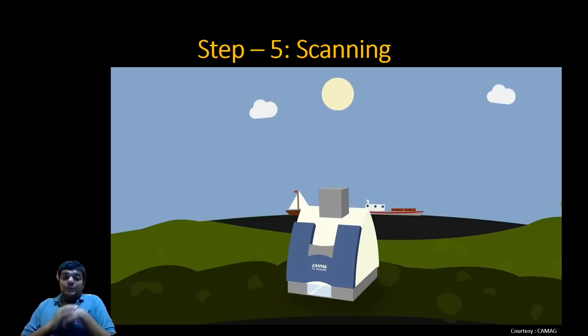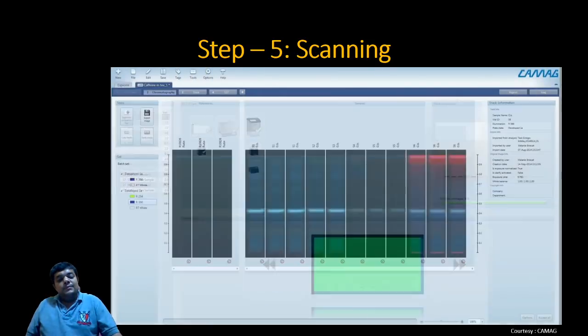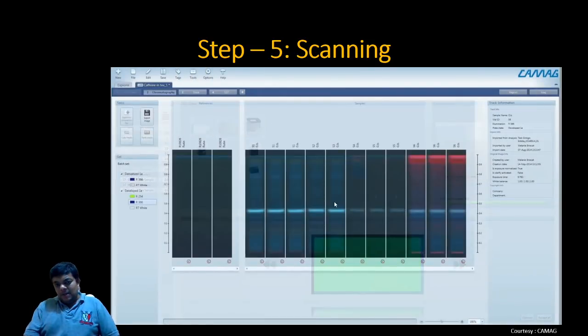So we will just go through that advanced method of scanning. Let us again go through this video. This is the second video of the same procedure, scanning. Low noise, high dynamic range images. See again, the green image in the background of the video is a clean image with no spots. But after the experiment, see what happened.